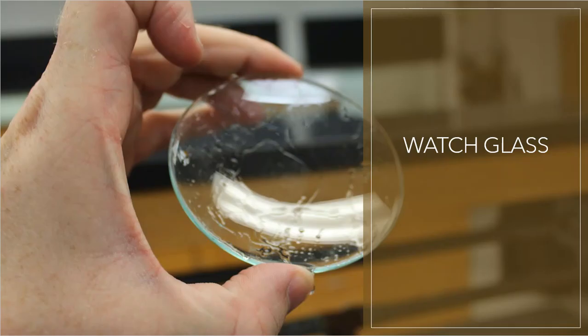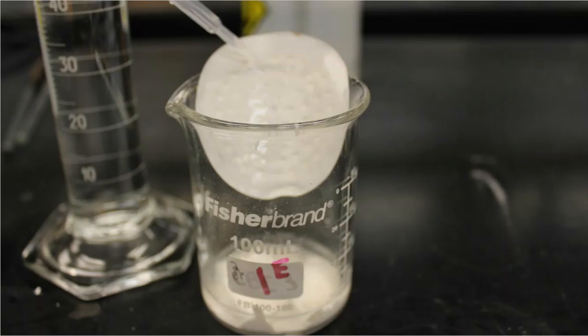And then I rinsed the watch glass with that 50-50 solvent to try to get as much of the crystal off as I could. Then I took the filter paper and also rinsed that with solvent, just to get any residual that might be left behind into that beaker as well. That beaker has my crystal, my solvent, and I need to recrystallize.